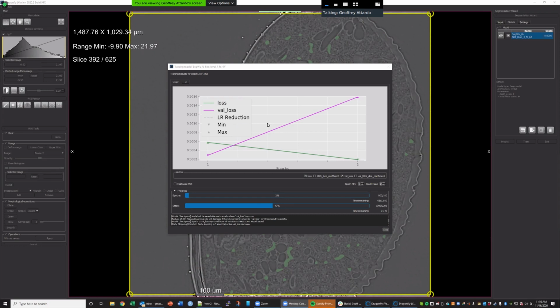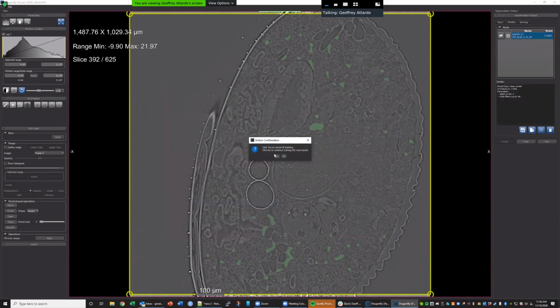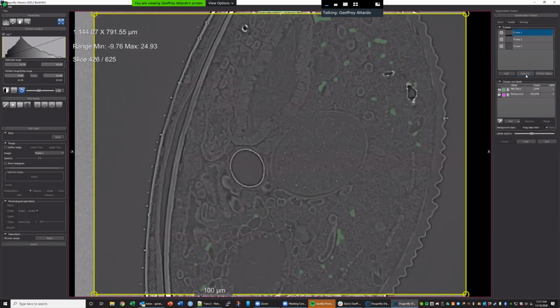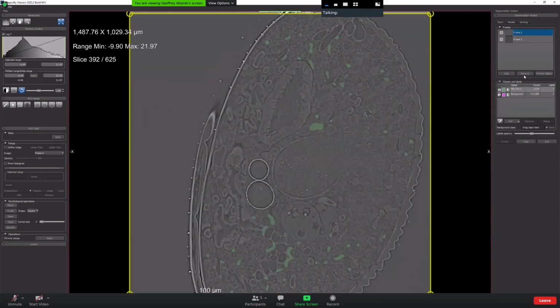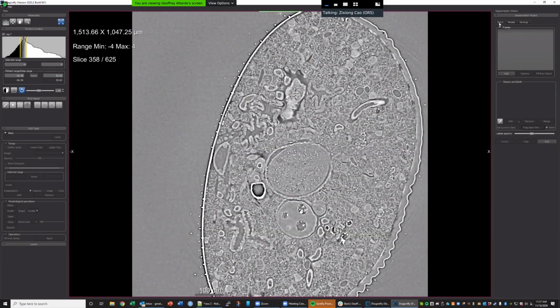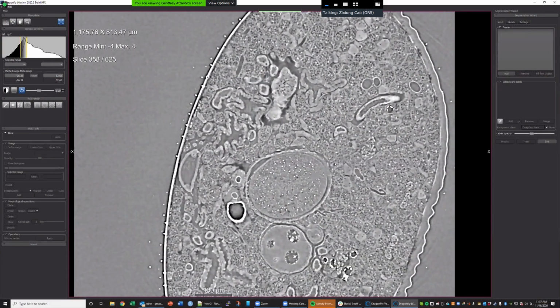Should I go back and choose smaller frames and restart maybe? If you want to see some result quickly, yes. Because I want to make sure you get something today. Let me go back and reset. So I'll just remove these frames. Can you try again to resize the frames? Sure. Oh, that's okay. You already did it, so try it next time.